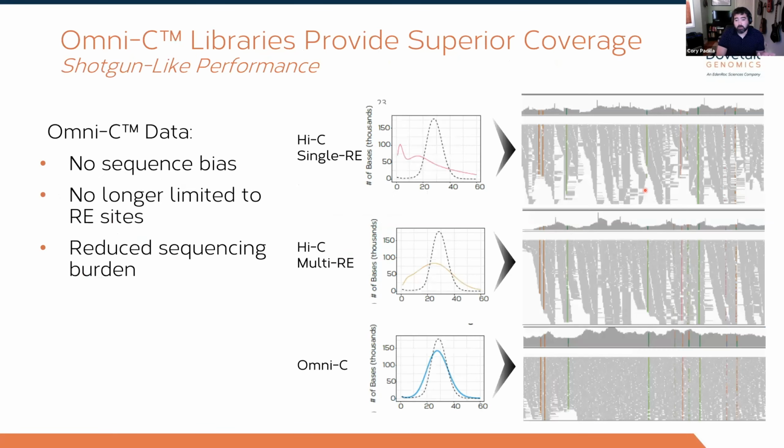And to hammer this home a little bit, if you just plot these data out on an IGV, right, you can see that in restriction enzyme-based data, there are just these gaps where you have no read pileup, right? And that's associated with those lack of restriction sites. Whereas with our DNase approach, we are getting very uniform data, and even regions that might be harder to sequence, we really don't see these exaggerated gaps that almost go all the way back to the single base level.